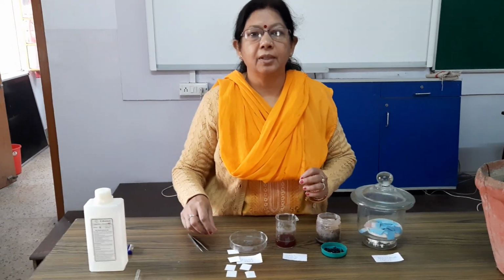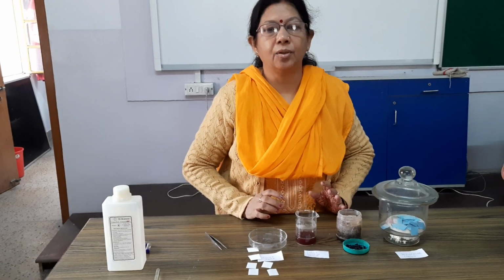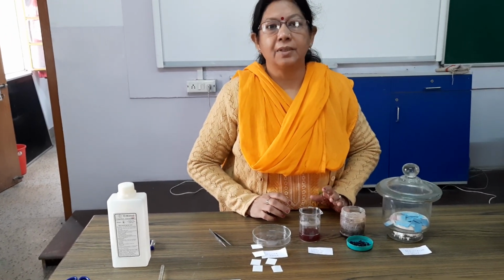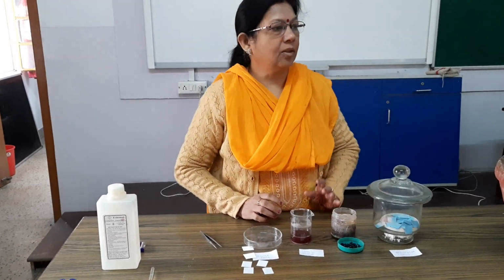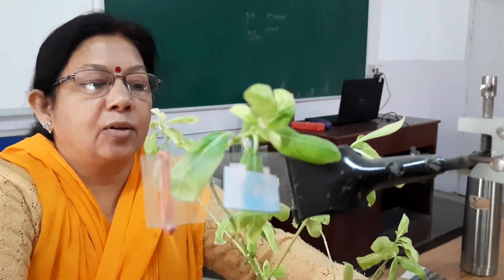Today we are going to see an experiment in which we will see the demonstration of unequal transpiration from both the leaf surfaces of a dicot leaf. Now, dicot leaf, how will you identify? I have taken here a dicot plant.